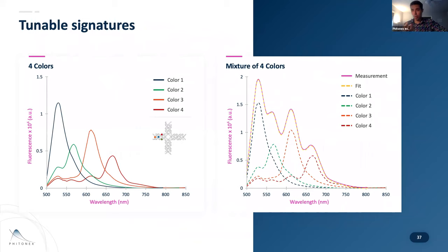So we created these four spectral signature dyes in 2 weeks, just based on what we knew about how our phytons were working. You can actually design these spectral labels really from scratch. Transparently, there's a lot of biology that stands between us and you using these as bona fide fluorophores for markers, but we have this capability to produce these spectral dyes.